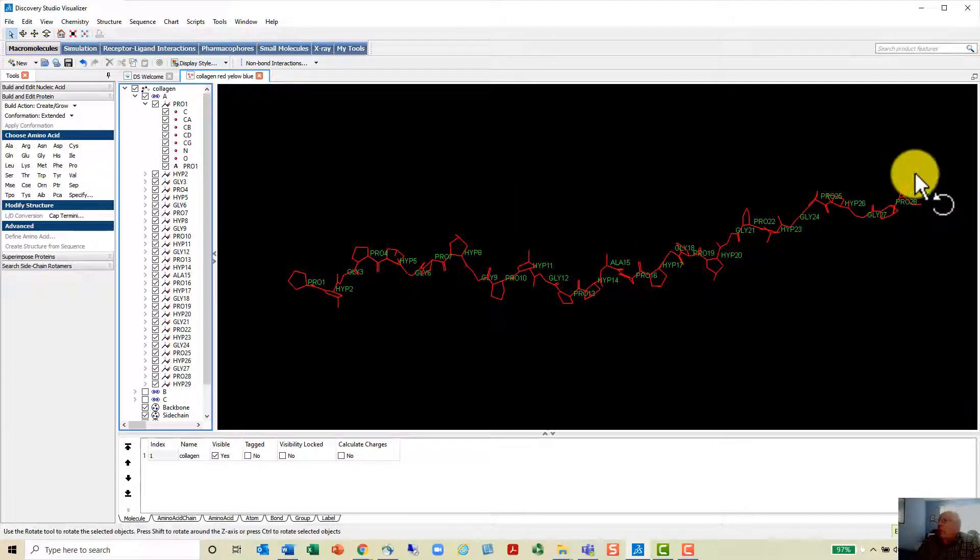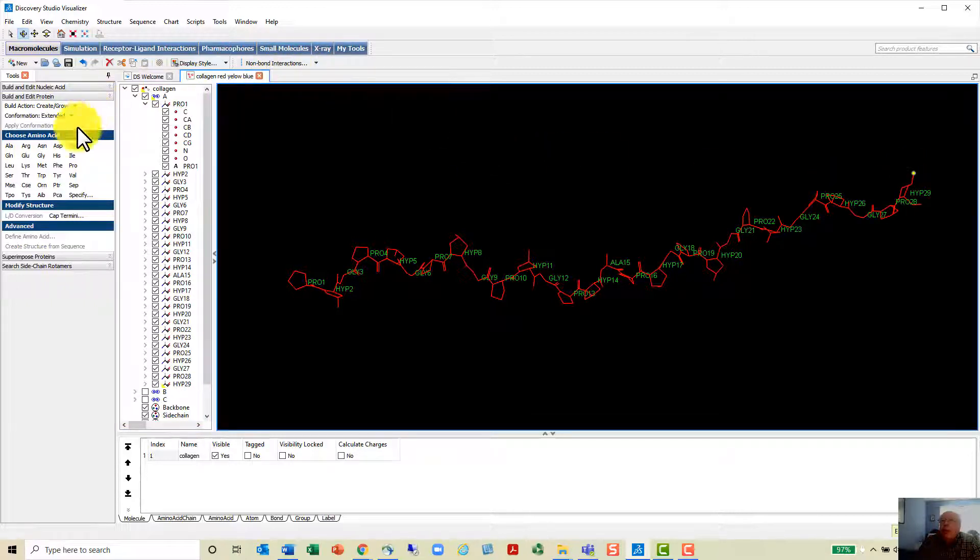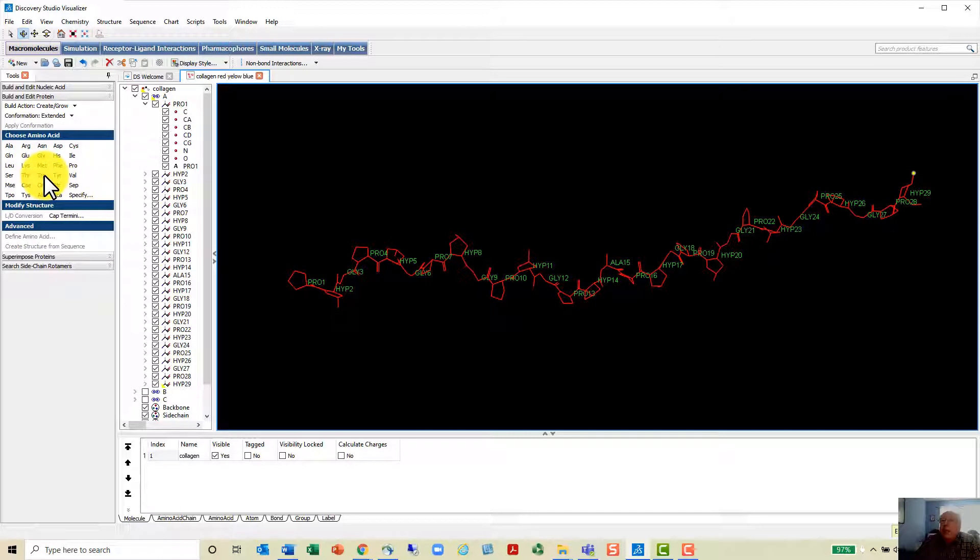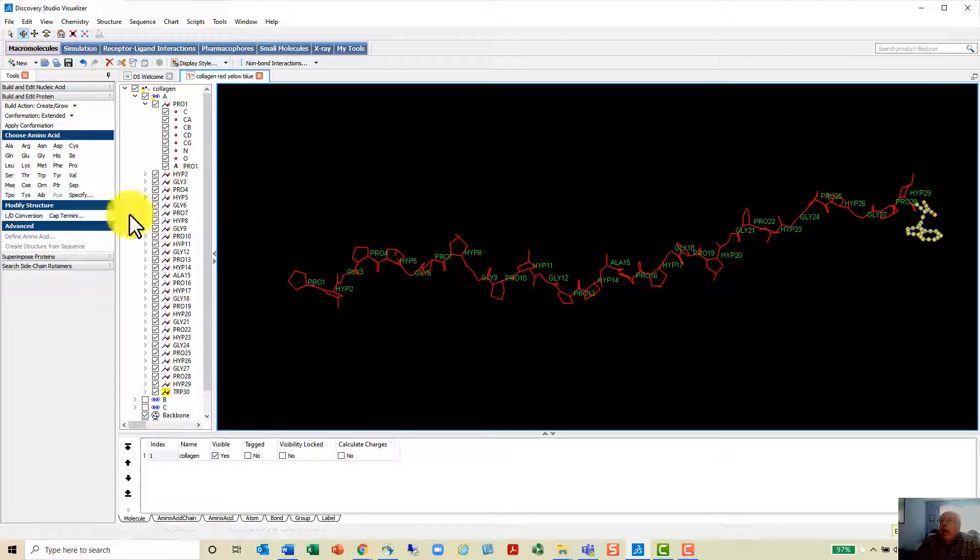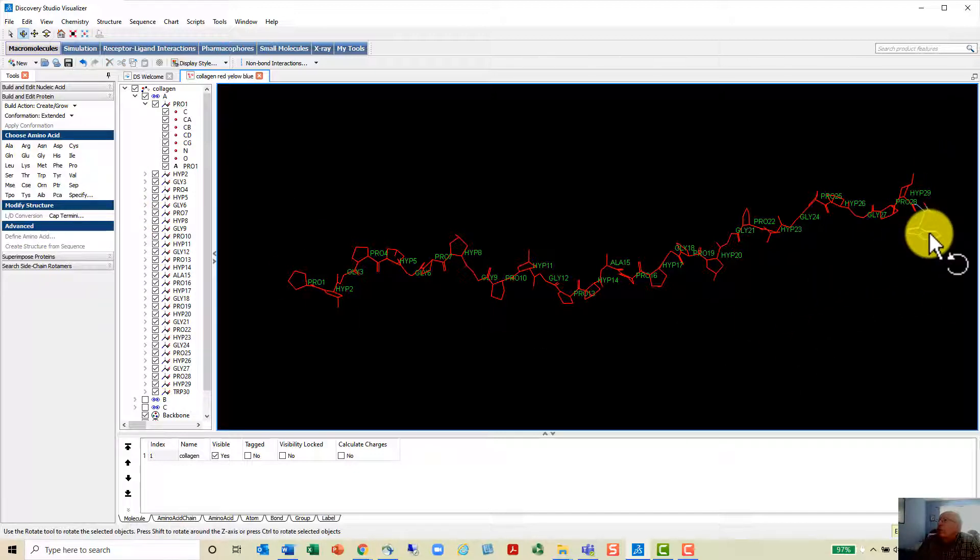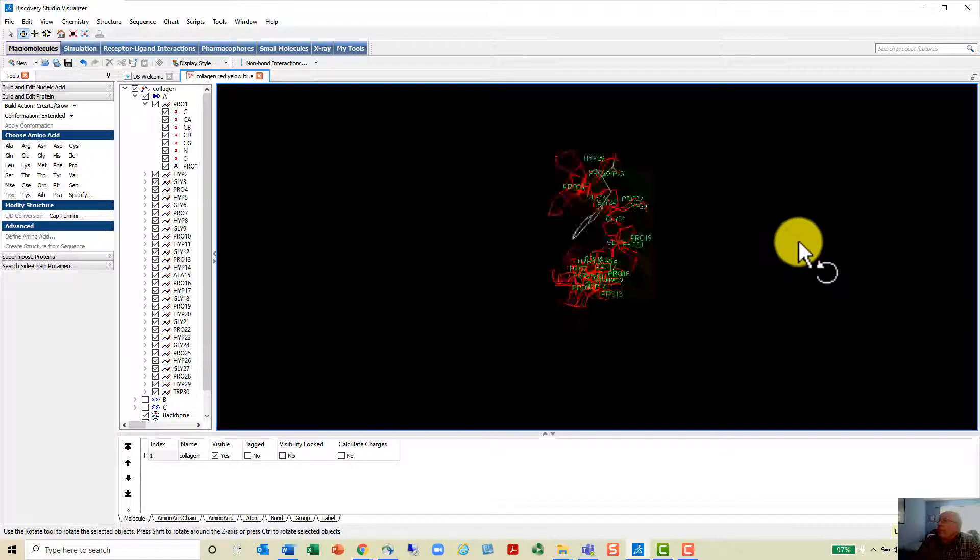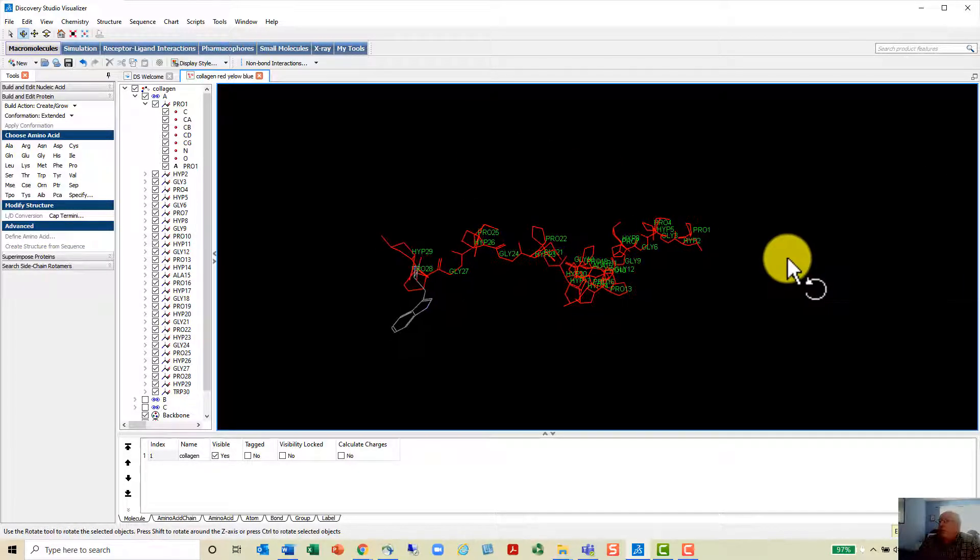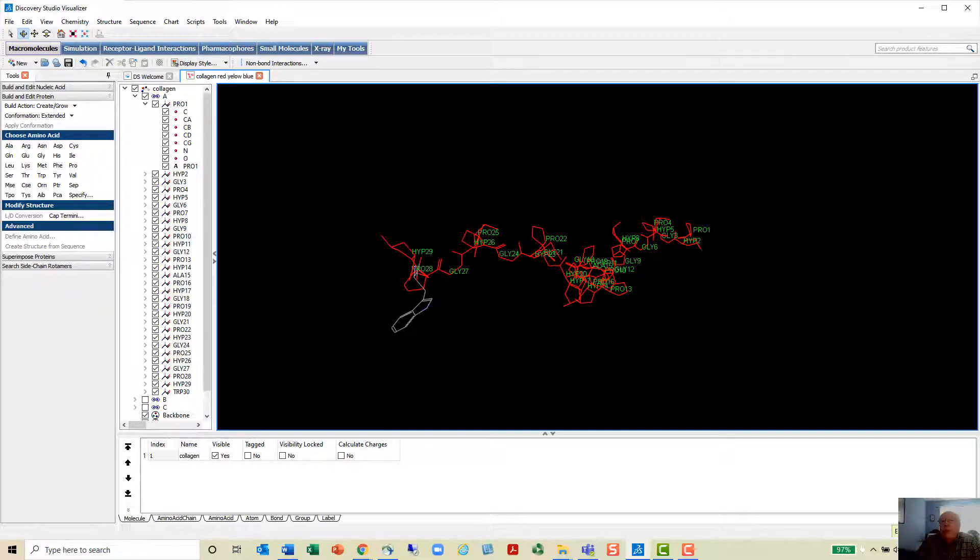You can actually add an amino acid down here. I'm going to add something nice and big like a tryptophan. There's a tryptophan added down here at this end. You can see the ring structure there of that tryptophan. I hope this is helpful to you and take care.